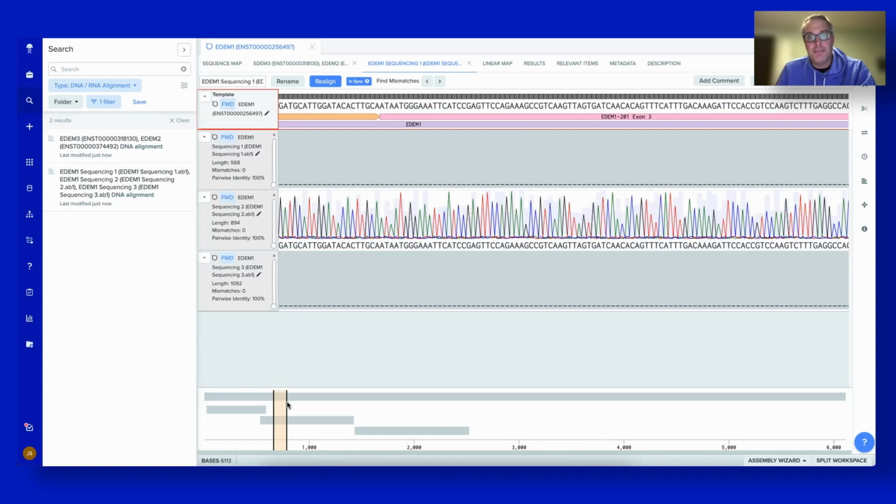It is also allowing me to do different types of work and different types of analysis because I can now include and modify different gap penalties and gap extension penalties, or run the alignment as a 6-mer or some other type of algorithm for defining these alignments.